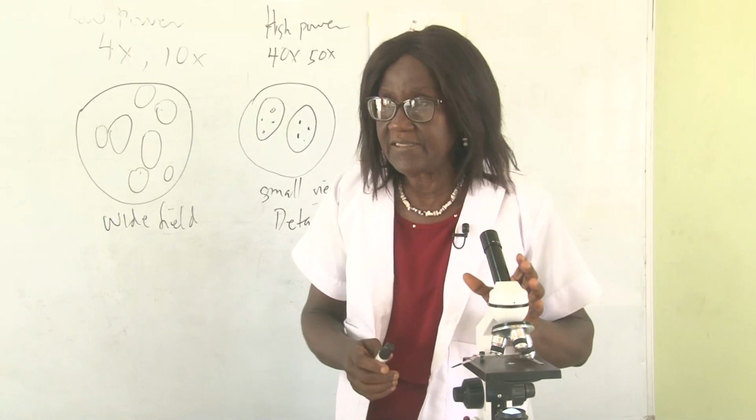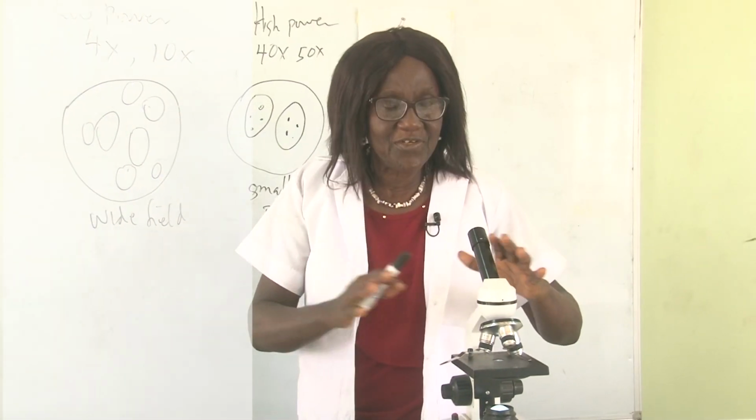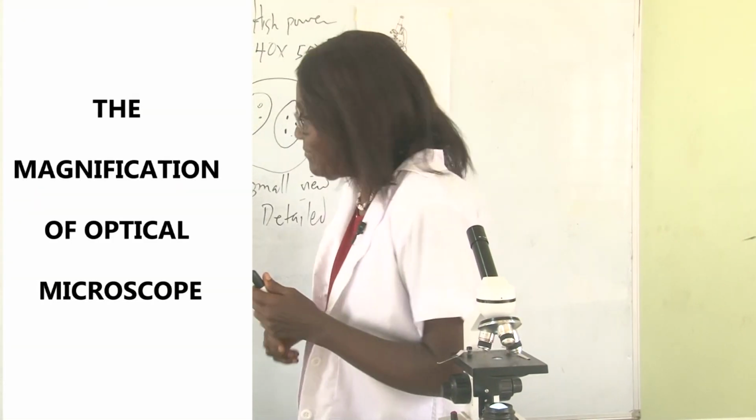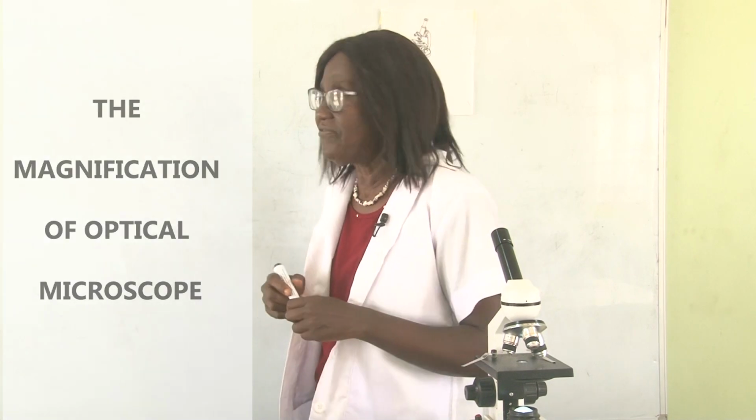Of the optical lenses. All right. Now let's look at the magnification of the microscope. If you see an object under the microscope, how large is it magnified?